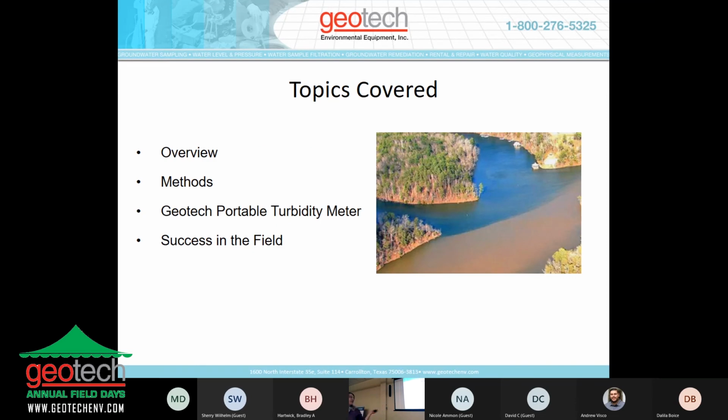Okay, so today I'll be providing an overview on turbidity itself, talking a little bit about the methods for analyzing for turbidity. I'll talk about our Geotech turbidity meter and some of its features. And finally, just some tips and tricks for success in analyzing for turbidity in the field.